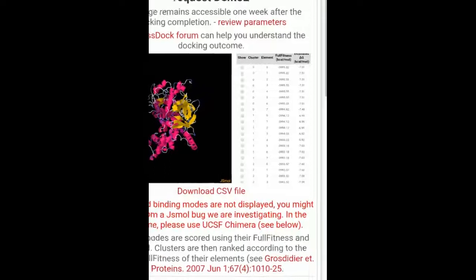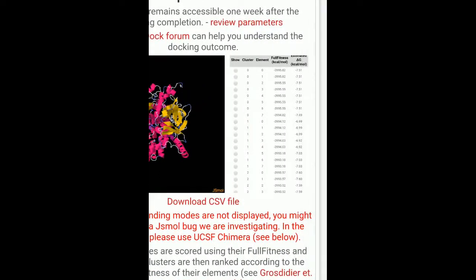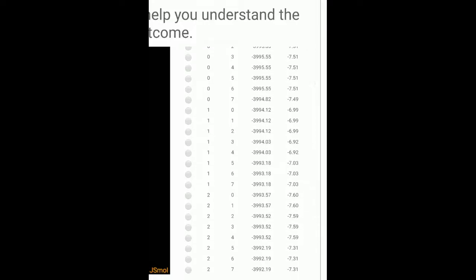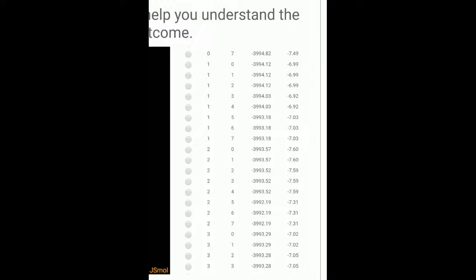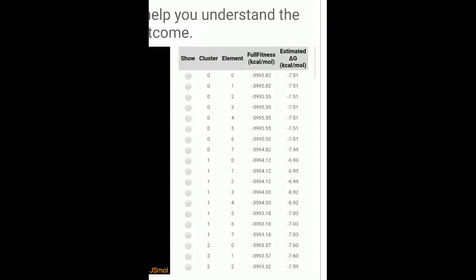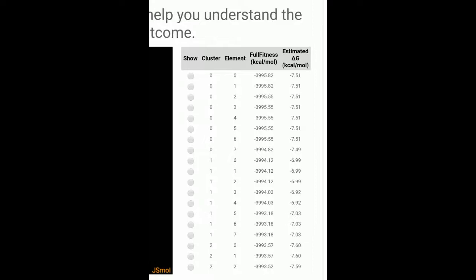Now we have got the results. These are the number of poses — a large number of poses has been obtained. You can see the best pose here. In pose 0, you have minus 7.1 and minus 7.51, which is the binding score for your 0th pose. For your first pose it is minus 6.99, and for your second pose it is minus 7.60. If you look at the full fitness in the 0th position, we are getting a full fitness which is high.